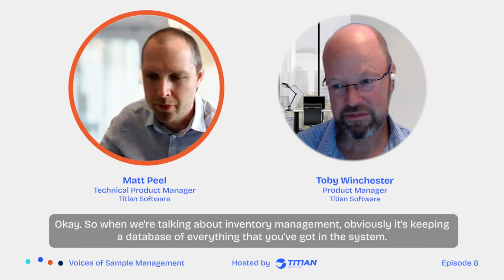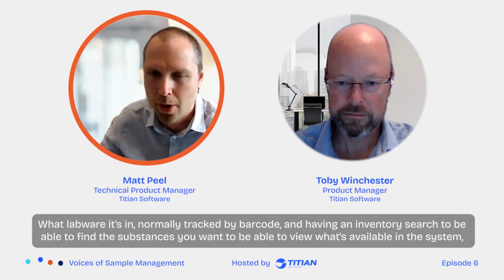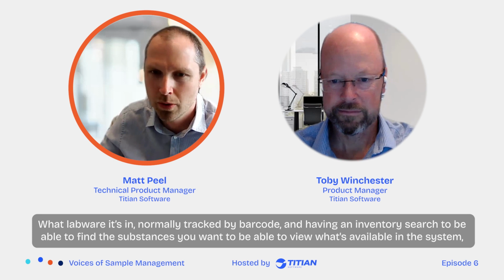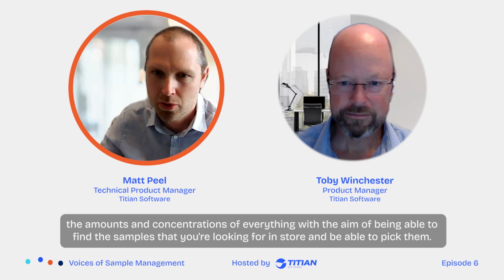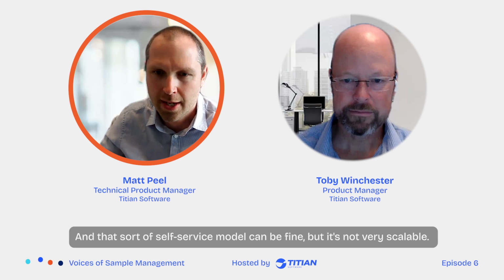Okay, so when we're talking about inventory management, obviously it's keeping a database of everything that you've got in the system, what labware it's in, normally tracked by barcode, and having an inventory search to be able to find the substances you want, to be able to view what's available in the system, the amounts and concentrations of everything, with the aim of being able to find the samples that you're looking for in the store and be able to pick them. And that sort of self-service model can be fine, but it's not very scalable.